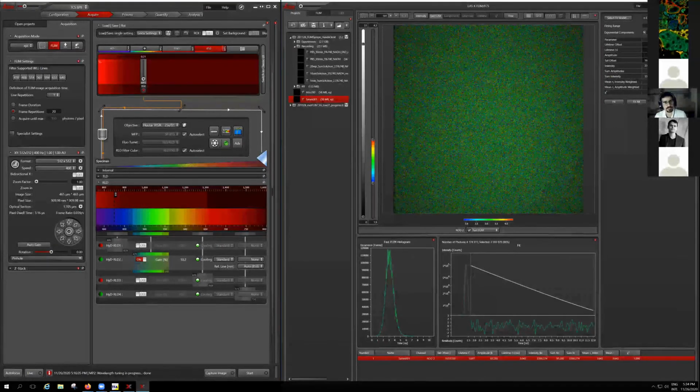But as soon as I use the tail fit, the contribution of the short lifetimes is just canceled out, ignored, and we are fitting the decay curve toward the tail, to the longer lifetime components. In that case the value that I'm getting is actually more correct. But it's not usually the case. So I'm surprised seeing that today, with the normal exponential reconvolution, I'm not getting the value that I'm expecting. Okay, so that's it so far.